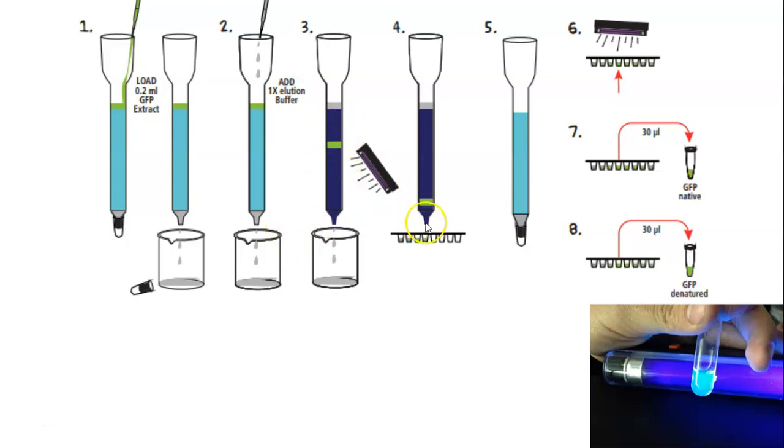And then the idea is when your protein is getting close to the bottom, you start to purposefully collect it. So instead of just having it drip into a waste container, you're starting to actually purposefully collect it. We can use tiny wells that collect different drops or different chunks of the liquid, but the idea is you do it until your GFP has come out, and then you cap it back up and are done.